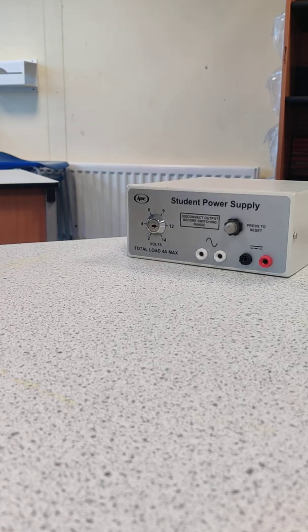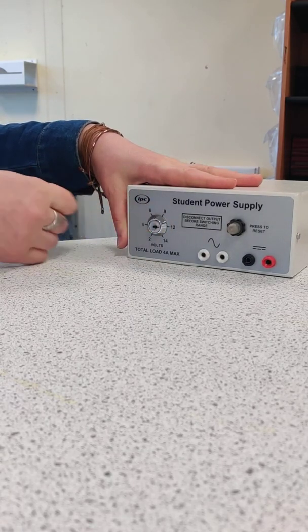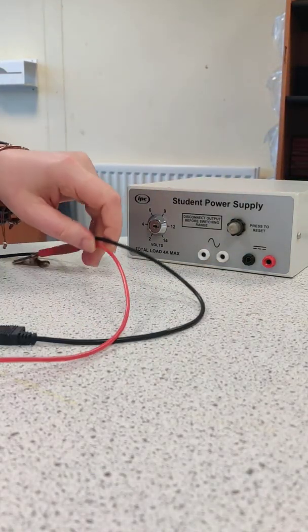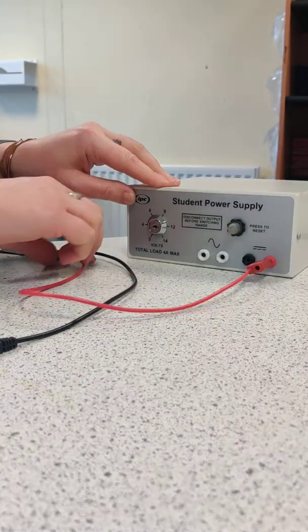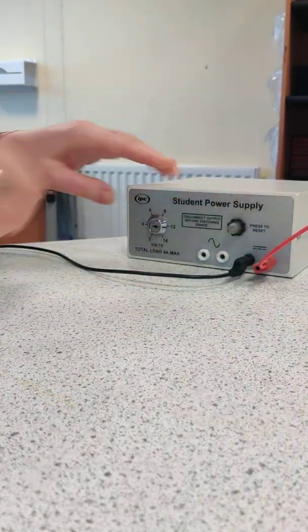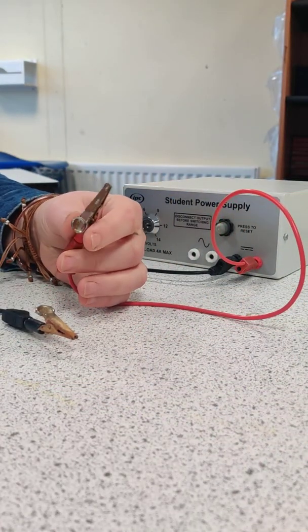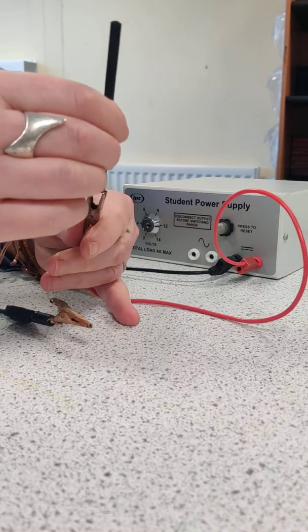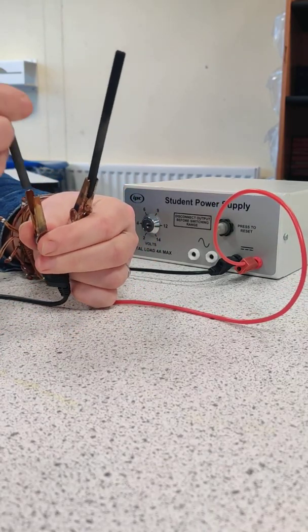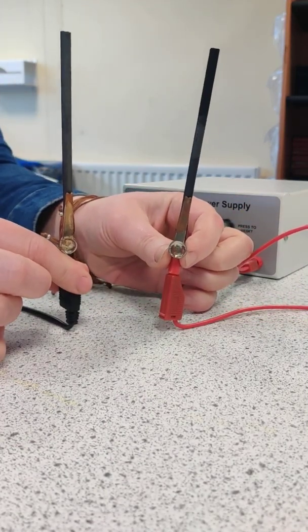First of all we need a power supply, and this is our power supply that we're going to use here, and it's set to 12 volts. Into that I'm going to plug two wires — our red wire for positive and black for negative — and at the other end of these are some crocodile clips. I'm going to put in there a carbon graphite electrode, so now we have a positive electrode and a negative electrode.